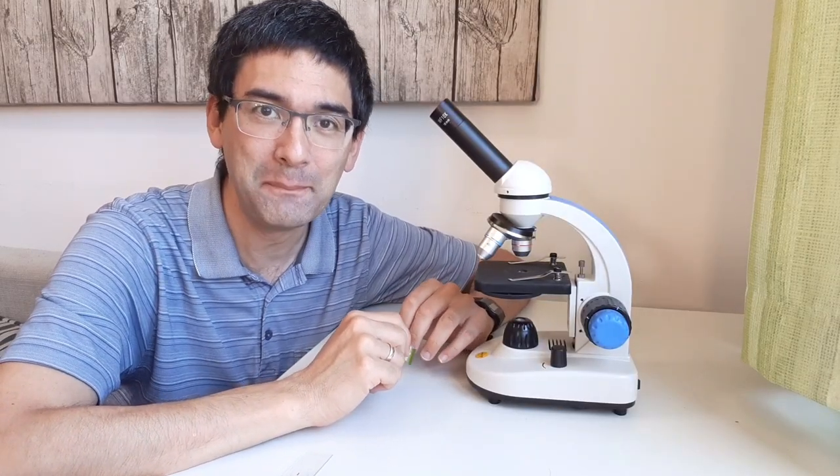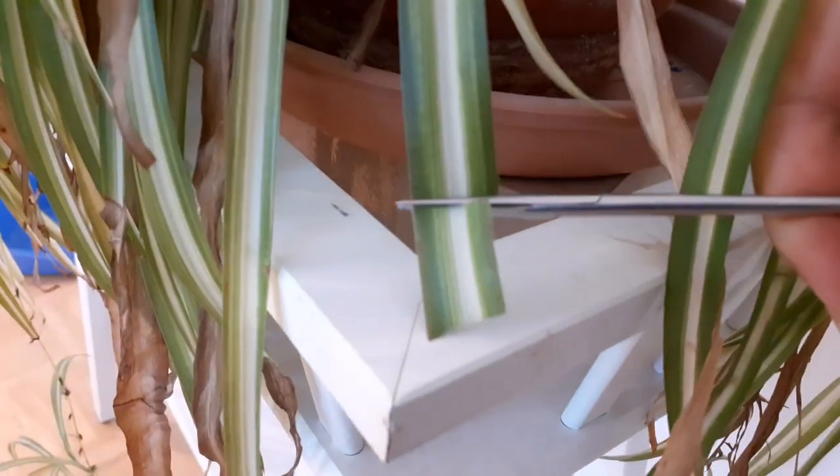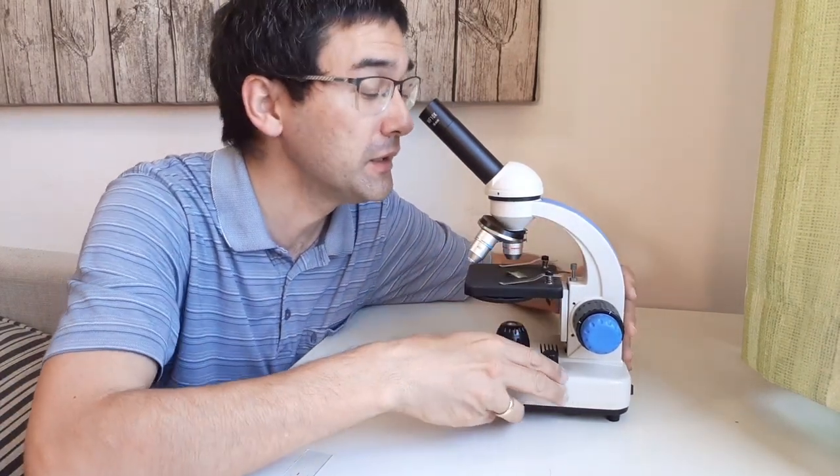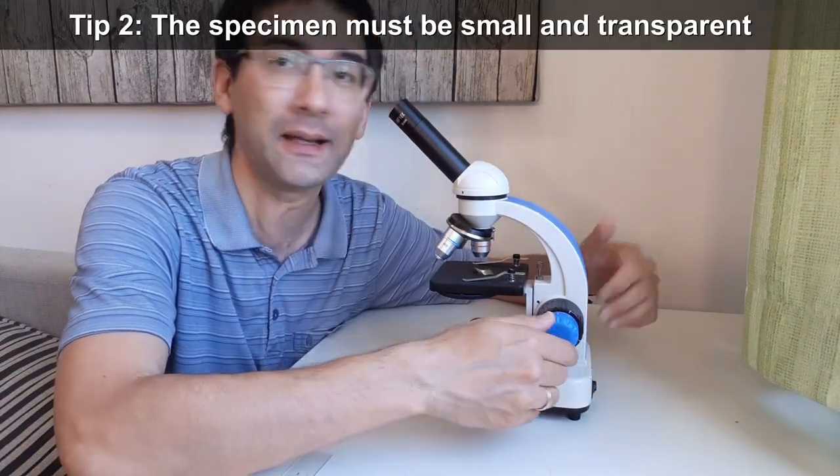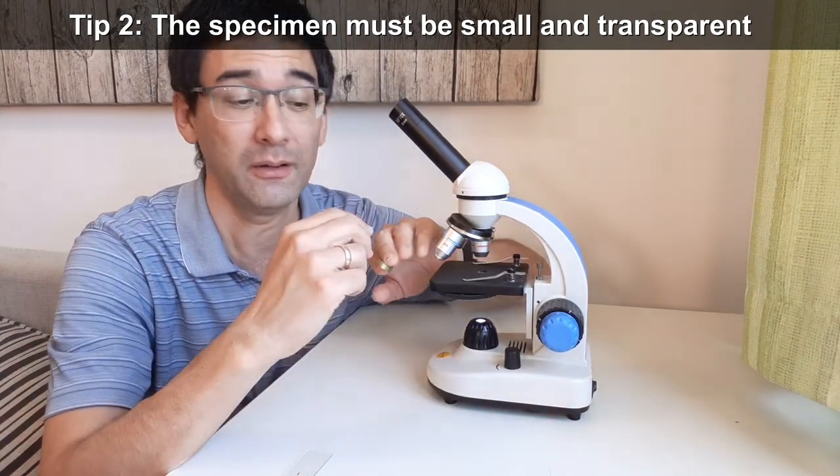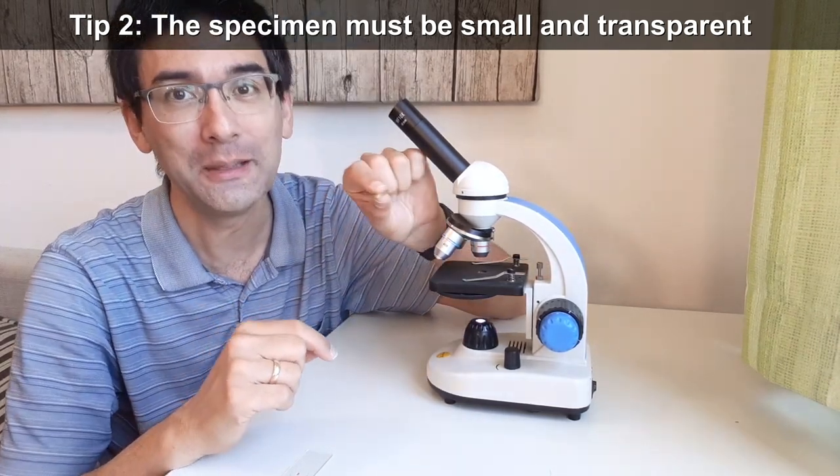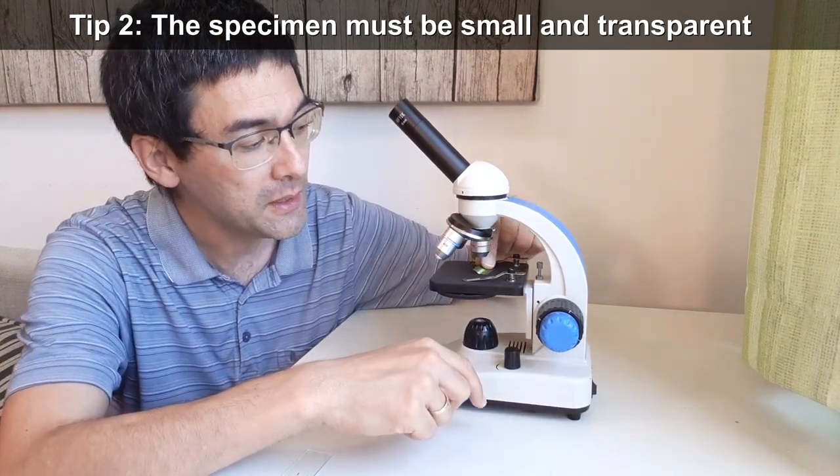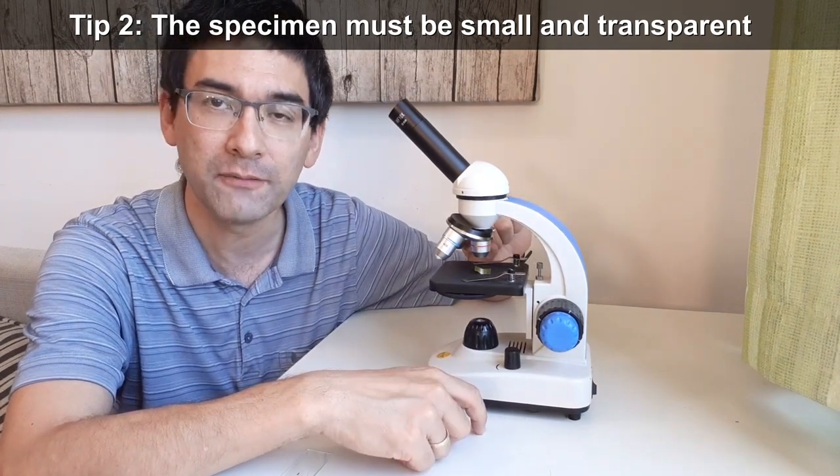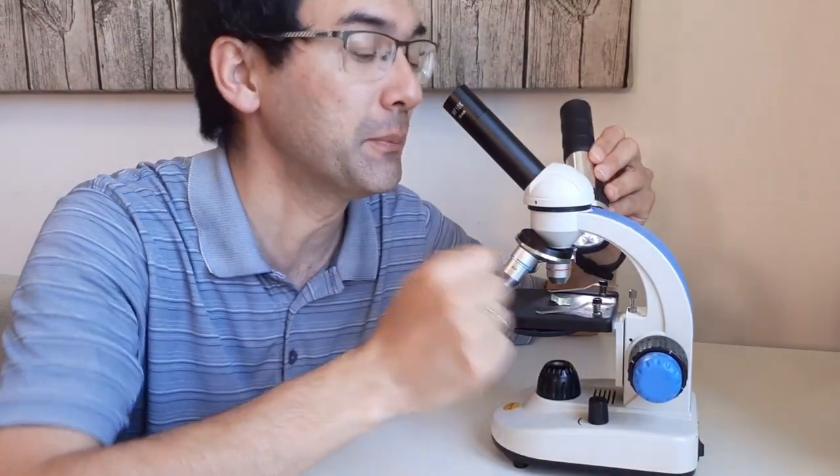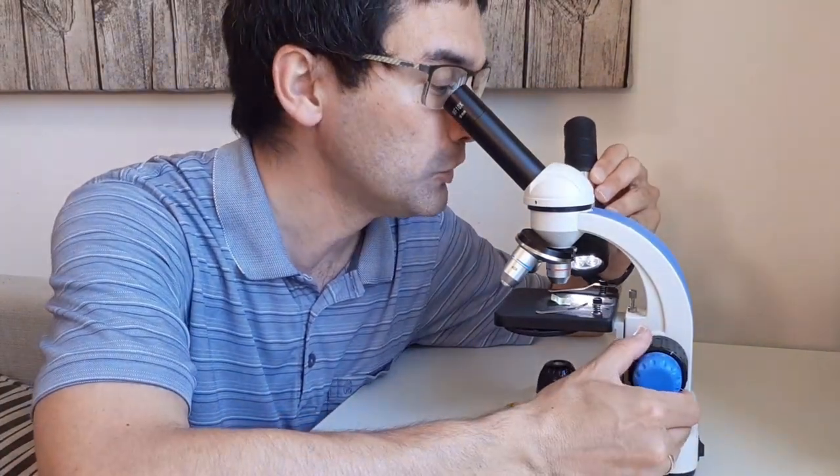Second problem is sometimes people put on here a specimen that is way too thick. For example, if you want to look at a leaf of a plant, then sometimes they will take the leaf and simply put it directly on the stage here. And then they're surprised that they don't see anything at all. And it's all black and it's all dark. So what's going on? Well, those leaves here, they might appear to be quite thin to you, but actually they are several cell layers thick.